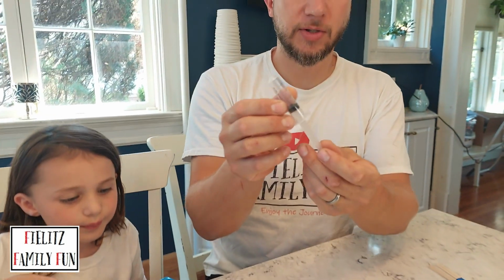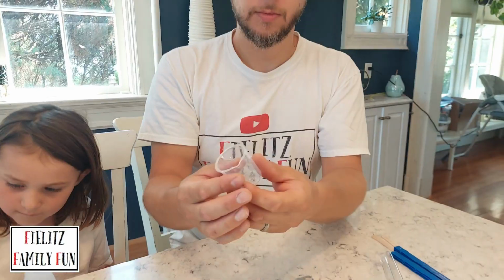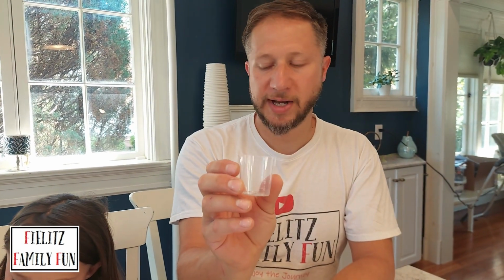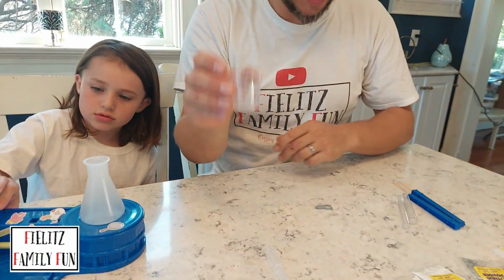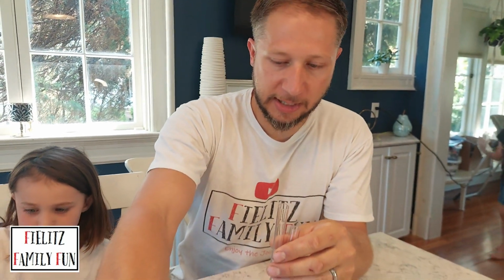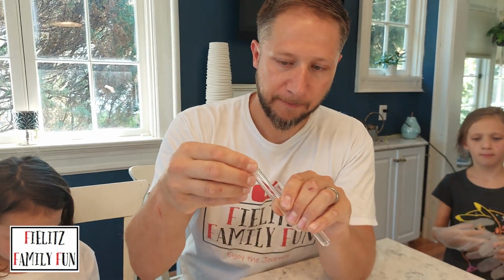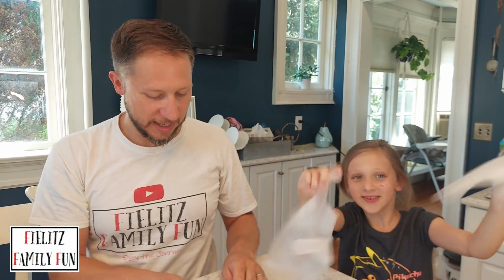All right, so we have a little syringe, measuring out some stuff. Pipette. We got here, I guess this is a beaker. This is called an Erlenmeyer flask. That's a funny word too. This is a beaker. We have 2 test tubes and 2 test tube stoppers. And this looks like the stands to hold them up. And 2 gloves.